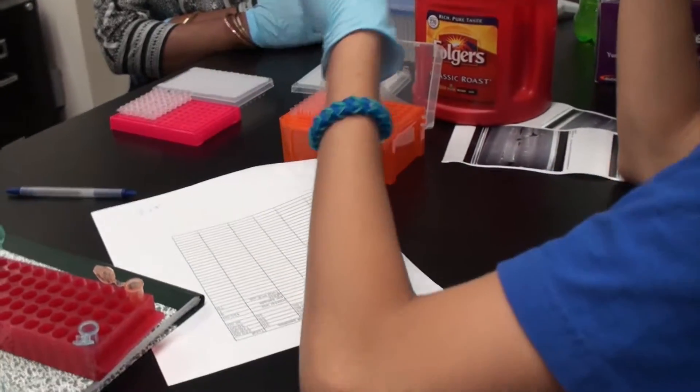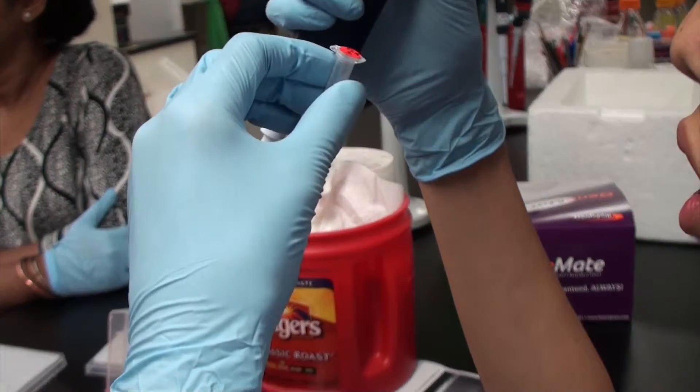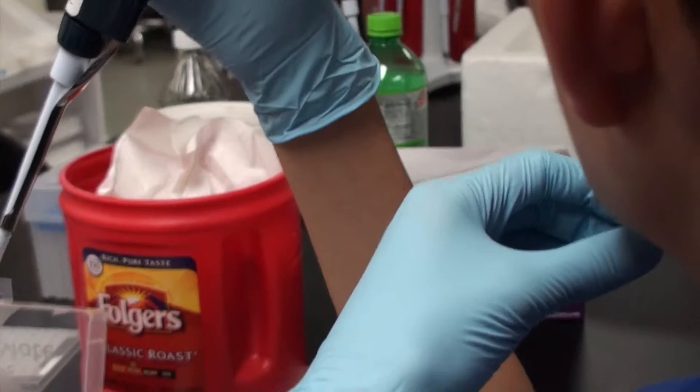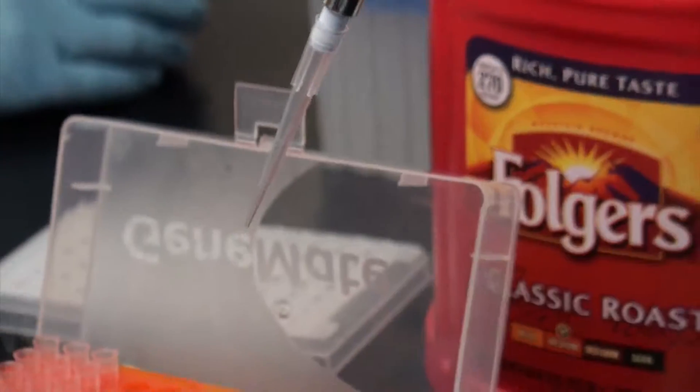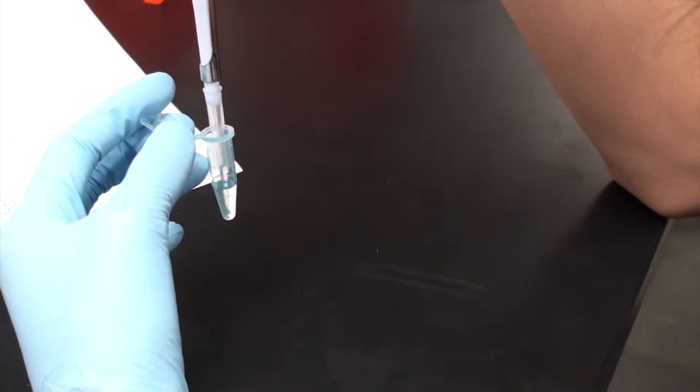After ExoSAP, it is time to cycle sequence. Cycle sequencing is similar to PCR except you will need two master mixes — one using only the forward primer and one using only the reverse. This will give you two sets of template strands, which will be a little bit different from PCR in that they will all be varying in lengths.